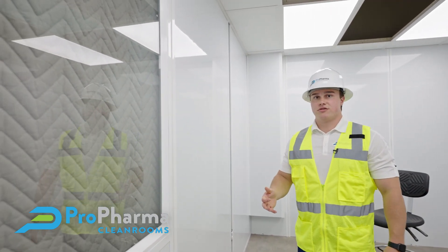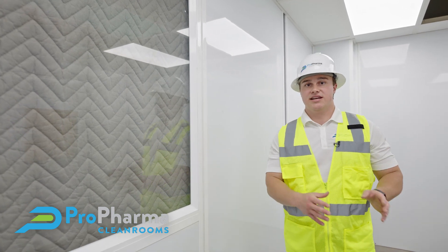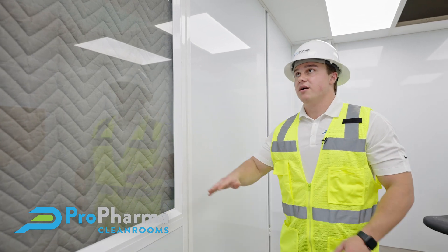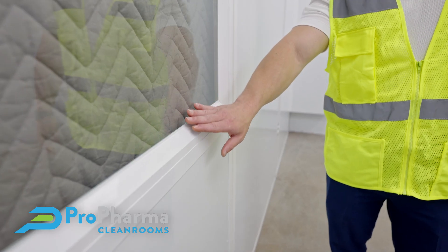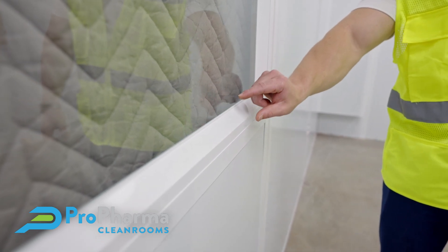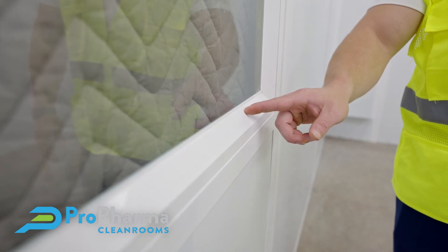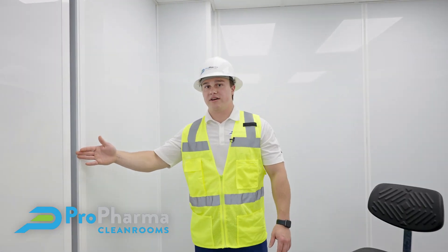You can see these windows. We've found that many end user groups like to have these windows so they can see the work going on inside the space from outside, without being gowned and garbed. One of the nice details about our windows is this ledge right here. You don't ever want a big, nasty ledge in a clean room that could collect a lot of dirt or dust. So in our design we've created this nice slanted ledge — it's very easily cleanable.